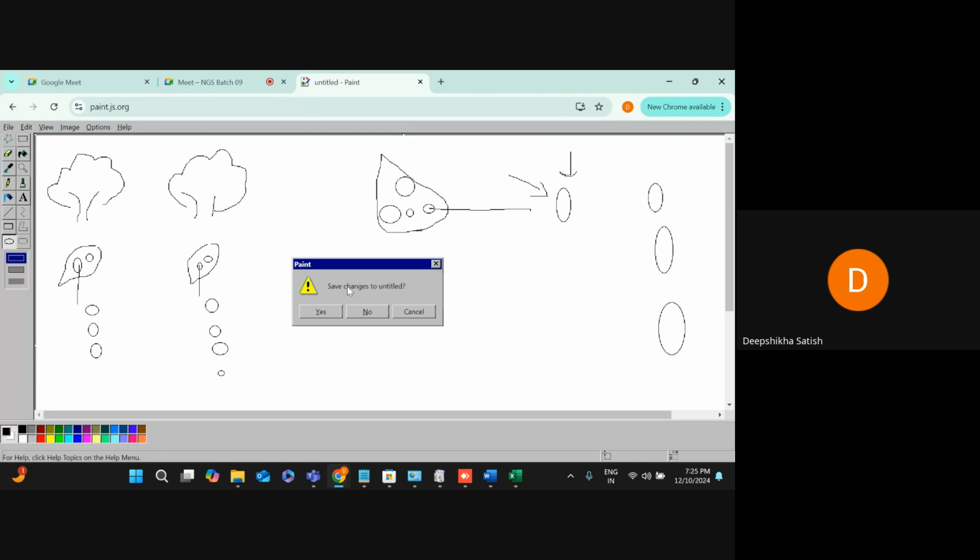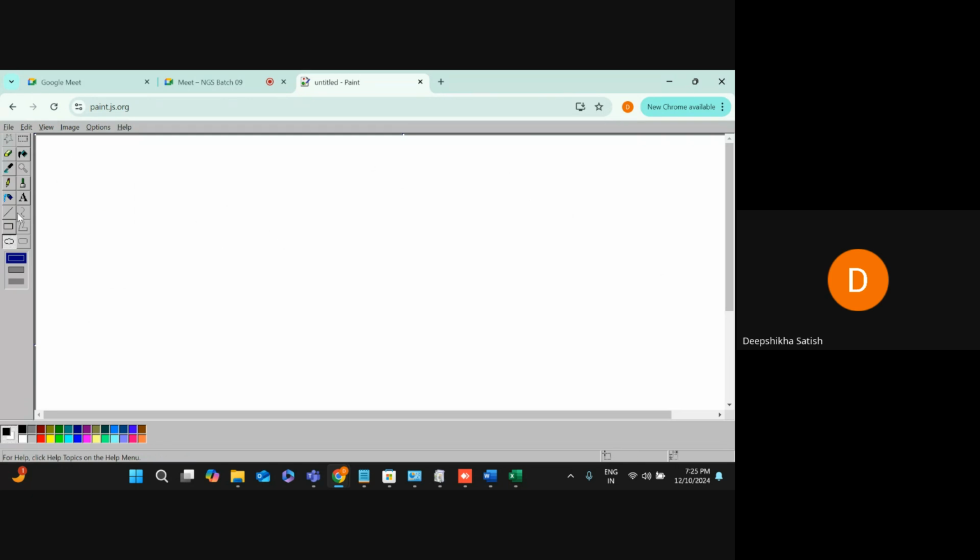So first, let's discuss what single end sequencing is. For example, this is a strand here. There are a forward strand and a reverse strand, right? In single end, we are ligating adapters at one end.